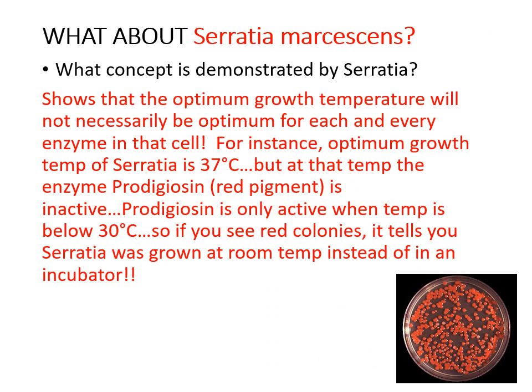Then we have our friend Serratia marcescens. And what's important about Serratia is whenever you see a picture of red colonies, okay, so we're not talking about the media, the agar turning red. We're talking about the bacterial growth itself being red, like in this figure here. Sometimes it shows more as a pinkish color.